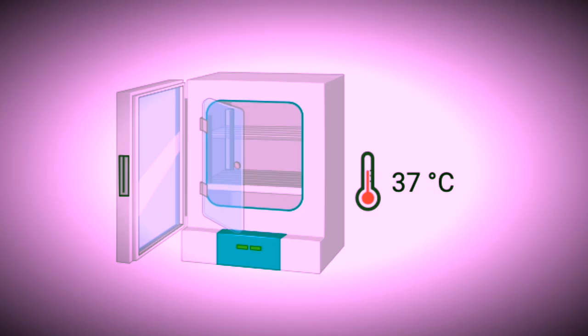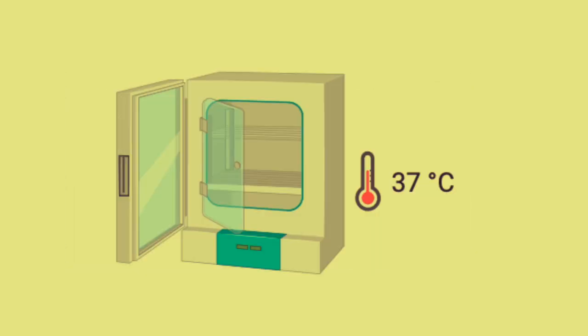The first step is to empty it out, remove all shelves, trays, and the water pan. Disassemble. Take apart any removable internal components. Drain the water pan and sterilize its contents before disposal. Unleash the bleach. Meticulously wipe down every single internal surface, so the walls, the ceiling, the floor, the gasket, with a fresh 10% bleach solution.